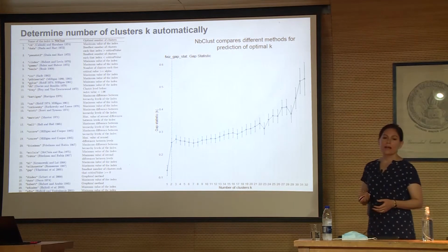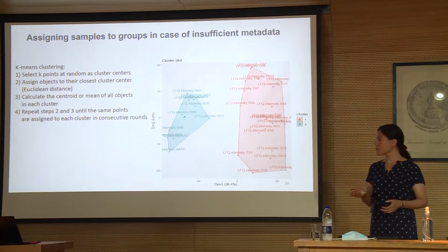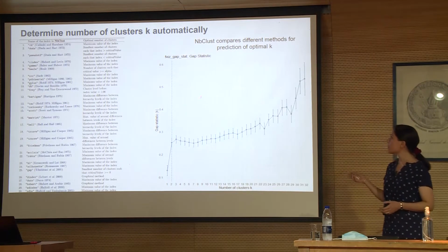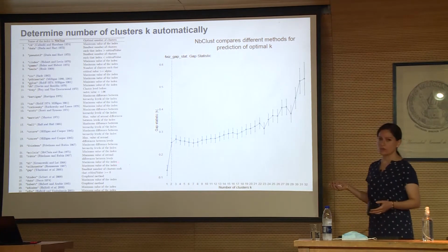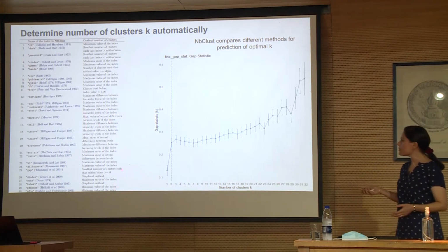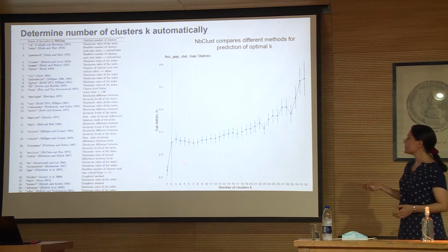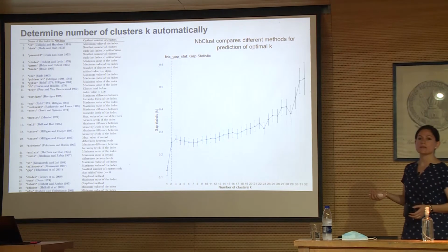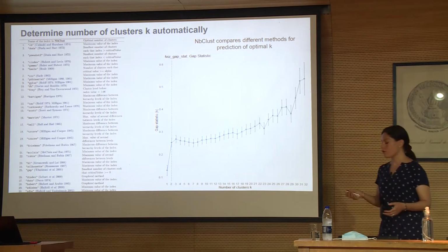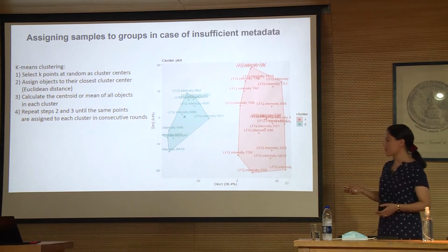This is another way, this method here, a k-means to look for the clusters. We also included this NbClust. It's another option, and we compare both methods trying to look for how many clusters we should have. So here, the important thing is when you see a huge gap. This is automatically done, and you say, okay, the highest gap is here, so I'm dealing with 2 clusters. That's what the workflow sees, and that's why it will classify it like that, in 2 clusters.